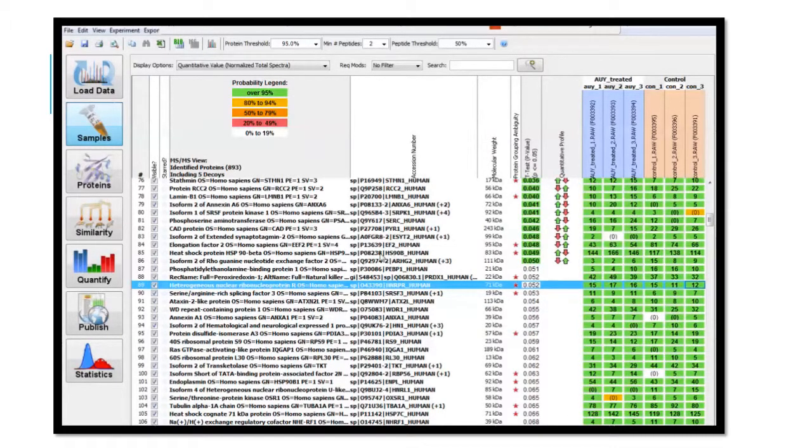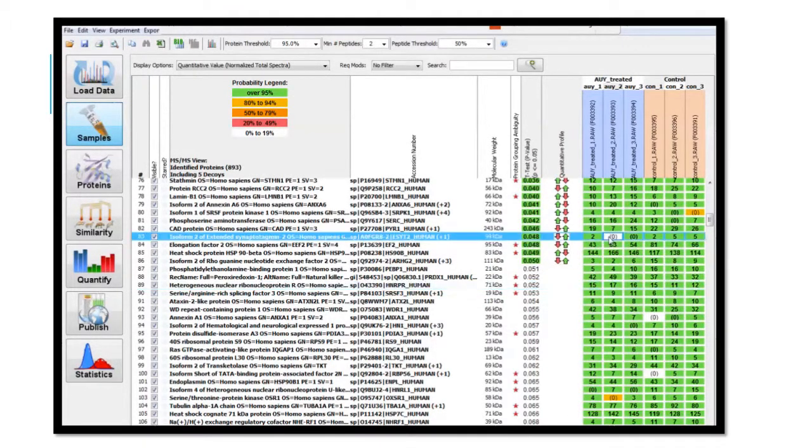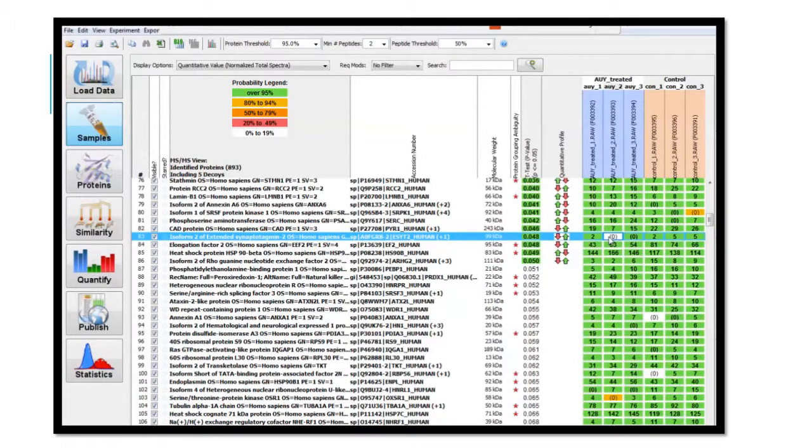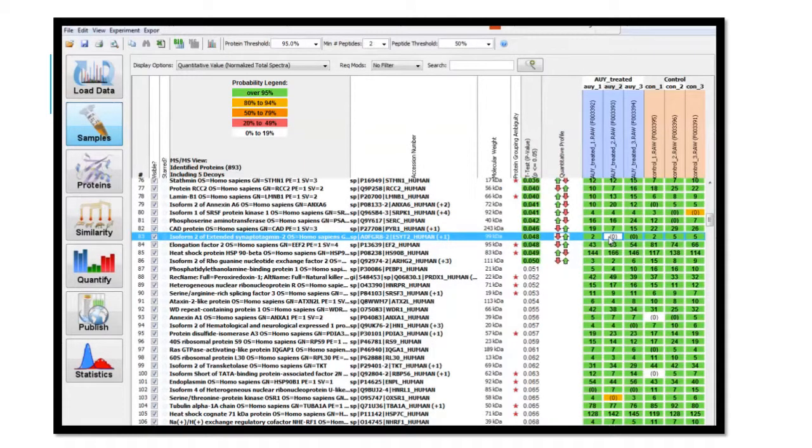For those data sets that have a zero or a gray box shown, that does not mean that the protein was absent. Consider that a baseline. Those proteins are expressed.